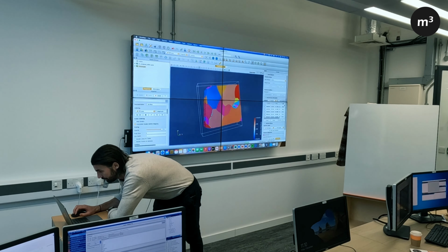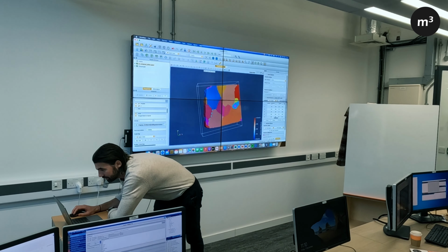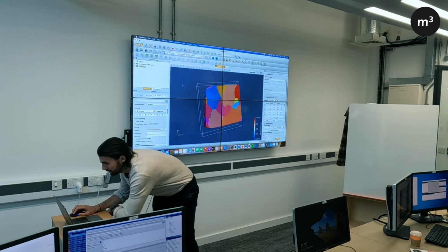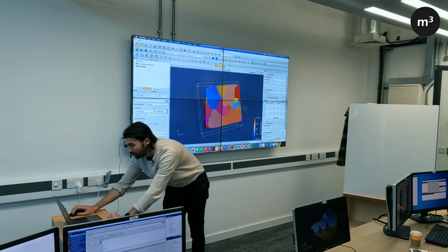Give it a sec. And this will tell you all the data it has for those cells you've selected, including the feature ID. Oh, sorry. Select cells with polygon, that's the one. This is selecting all the ones in that volume. Let's go there. And this will tell you the feature ID, and then we know that that grain is numbered 164, we can see there.